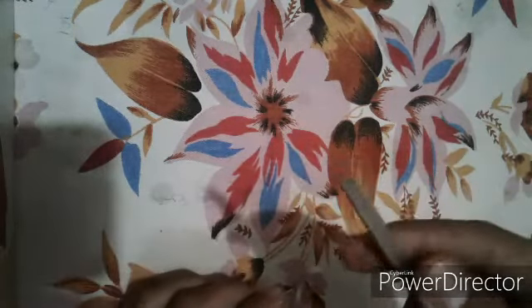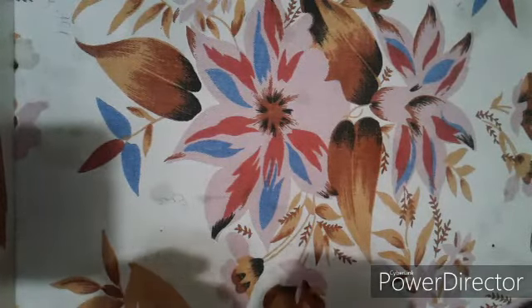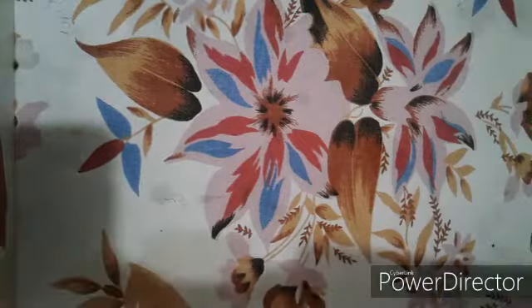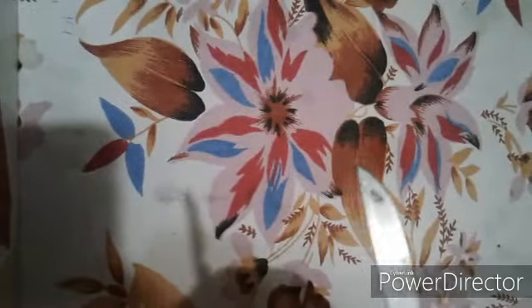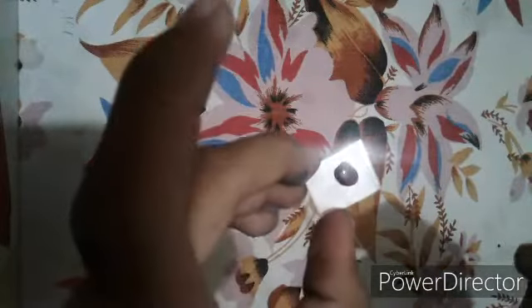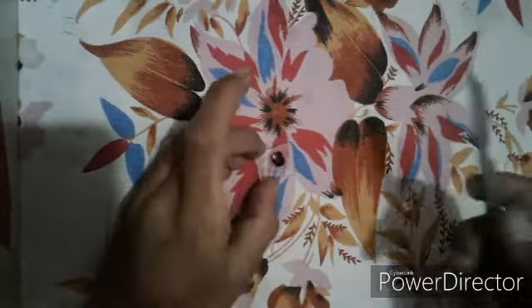We are going to stain it with iodine solution. You can see this is our slide, and now we have stained it with iodine solution.